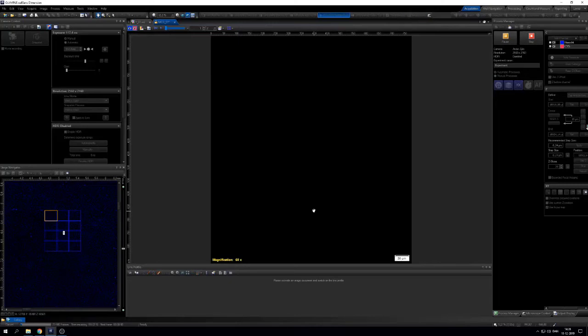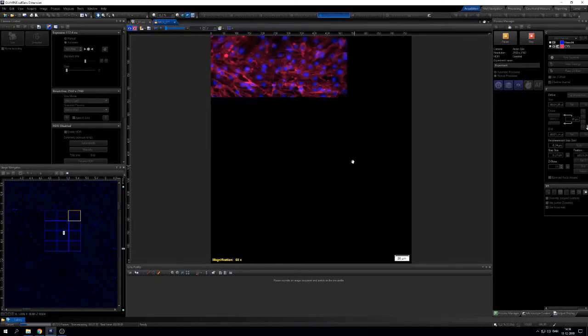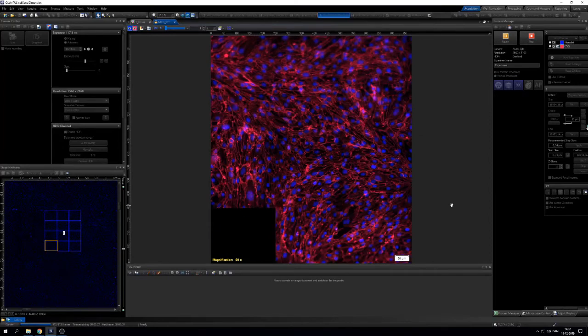You can see some of the first images here. In the lower part you can see the estimated time of 2 minutes something. So these are the first 2 images. And now it's done.